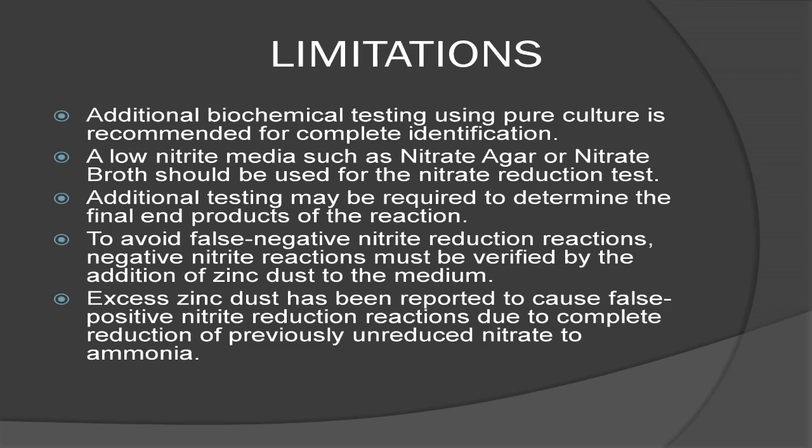Next, a negative zinc reduction, or no color change, in combination with a negative nitrite reaction is a presumptive indication that the nitrate was reduced beyond the nitrite stage. Although a very common end product of nitrate reduction is nitrogen gas, other end products may be formed. Additional testing may be required to determine the final end product of the reaction.